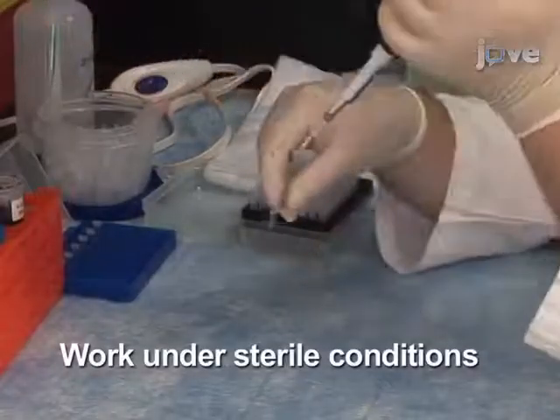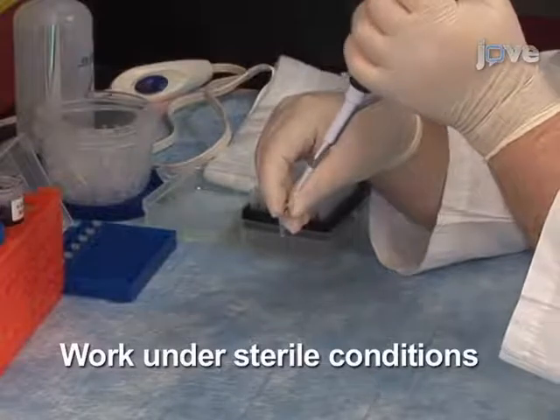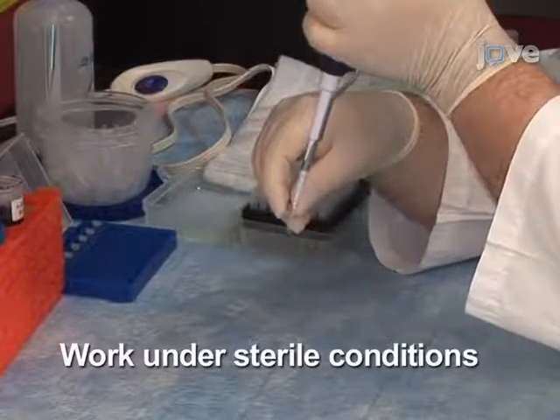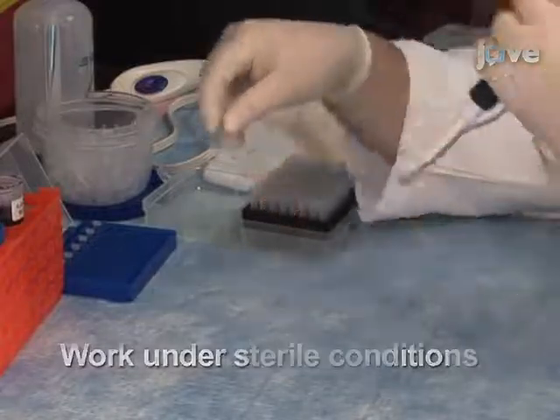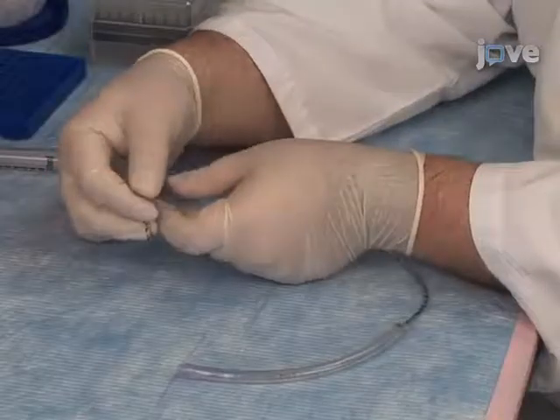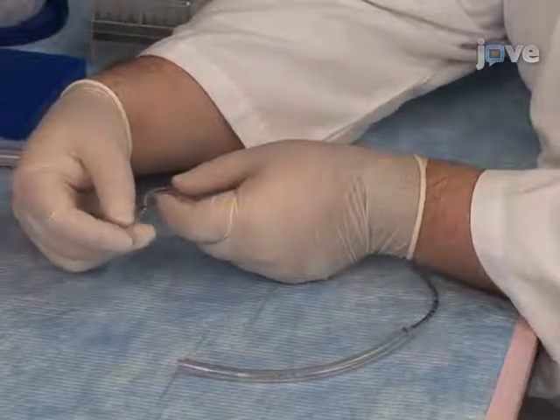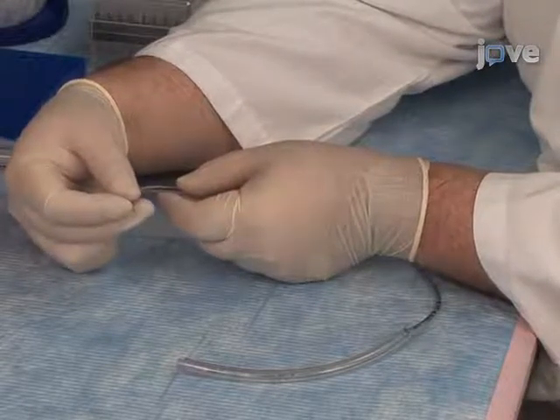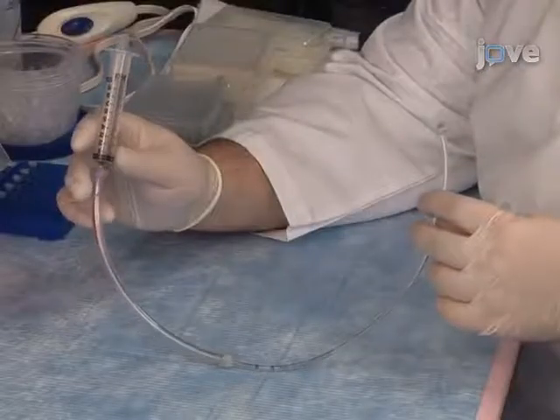First, prepare the injection solution in a microcentrifuge tube. In this example, the inoculums contain Trypan Blue for better visualization of the injection site. To inject mice, use a sterilized and calibrated glass micropipette needle attached to a series of plastic tubing gradually increasing in diameter and ending in a 3-milliliter plastic syringe.